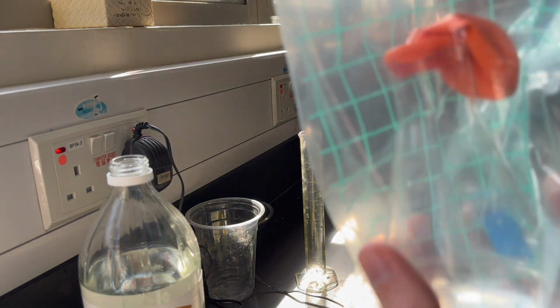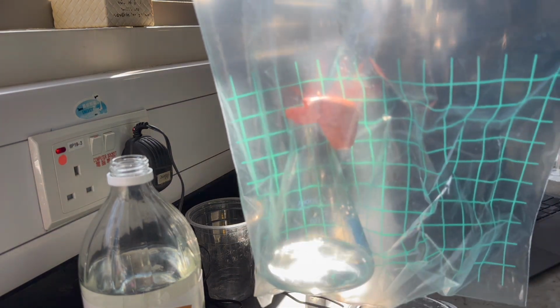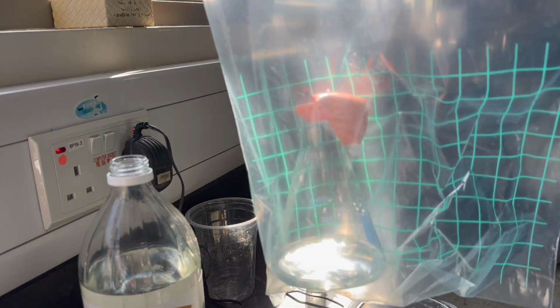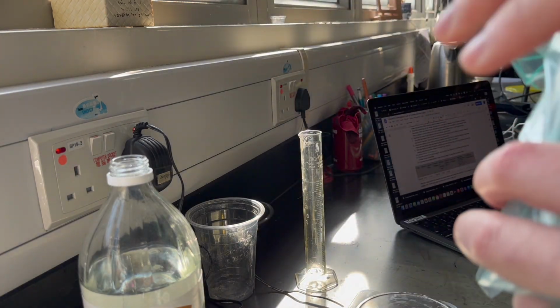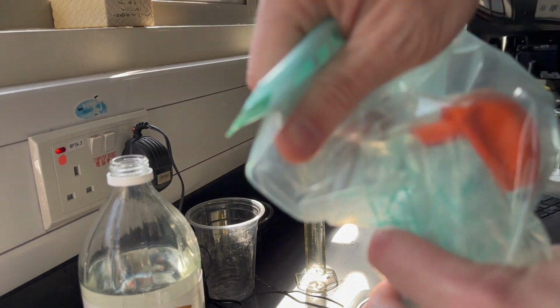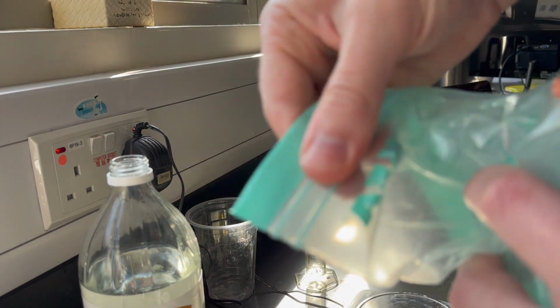Okay, so I've got to be careful with the bag though. I don't want the bag to be puffy or full of air because that's just going to add mass. So I'm going to squeeze out as much of the air as I can from the bag and then seal the bag.